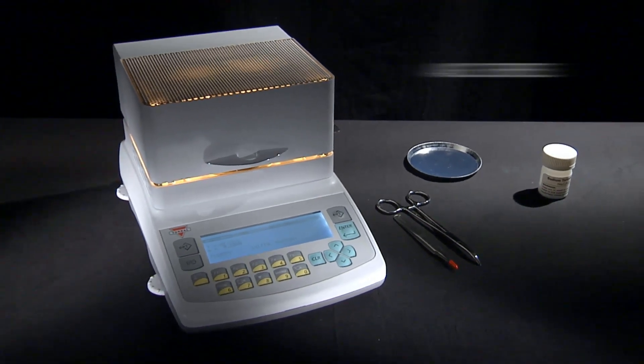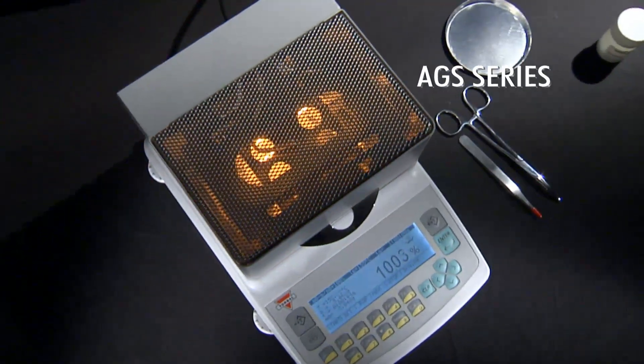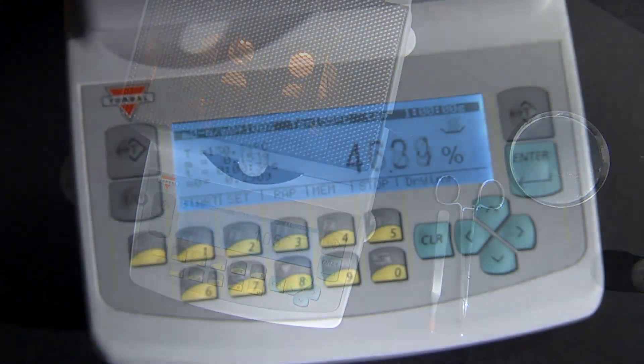Introducing the Torball AGS Moisture Analyzers: rugged, precise, and easy to use. Built on the AG platform, the AGS delivers the ultimate in speed and accuracy.